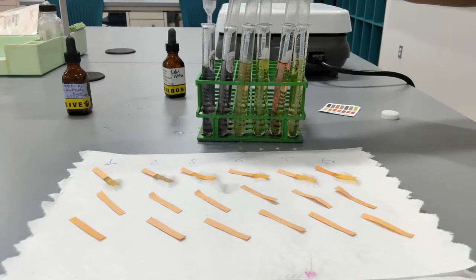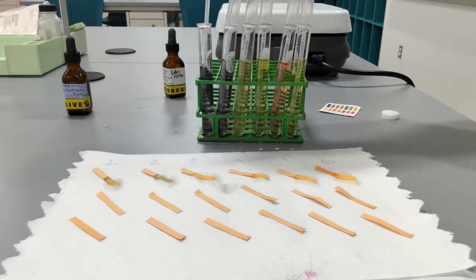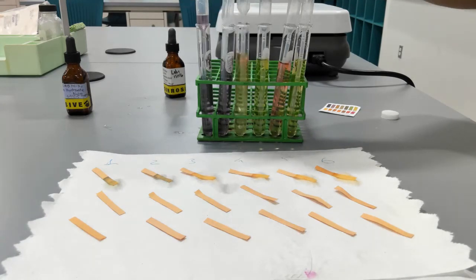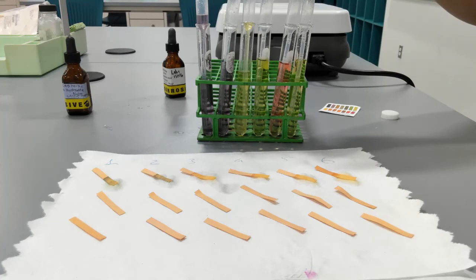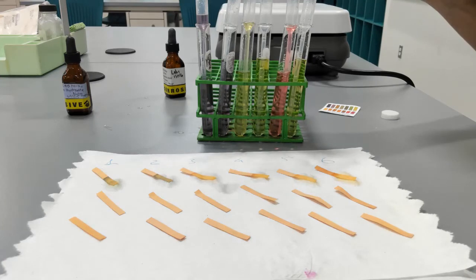Let's mix it thoroughly by pipetting up and down. You can see that only the tube with water changed its color.